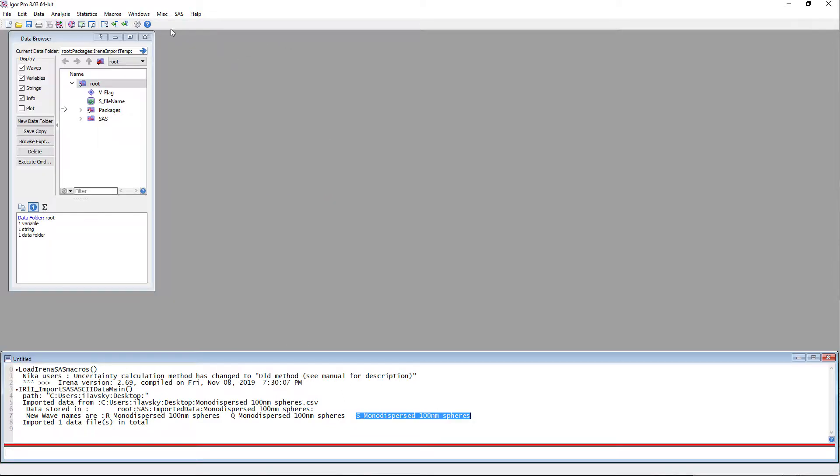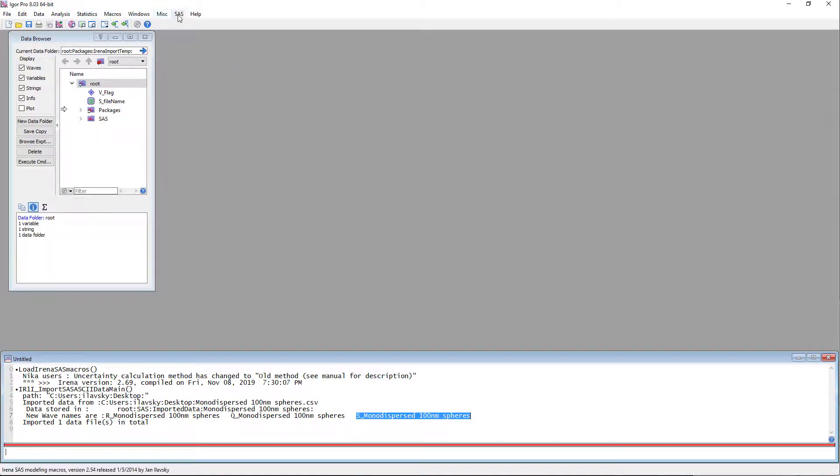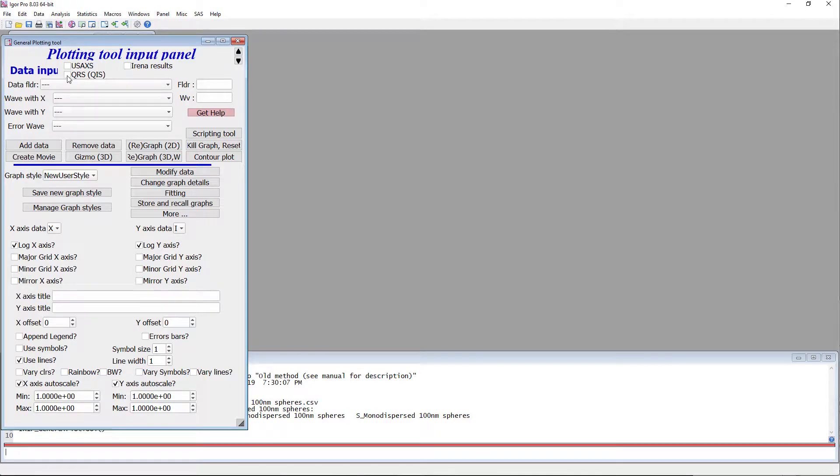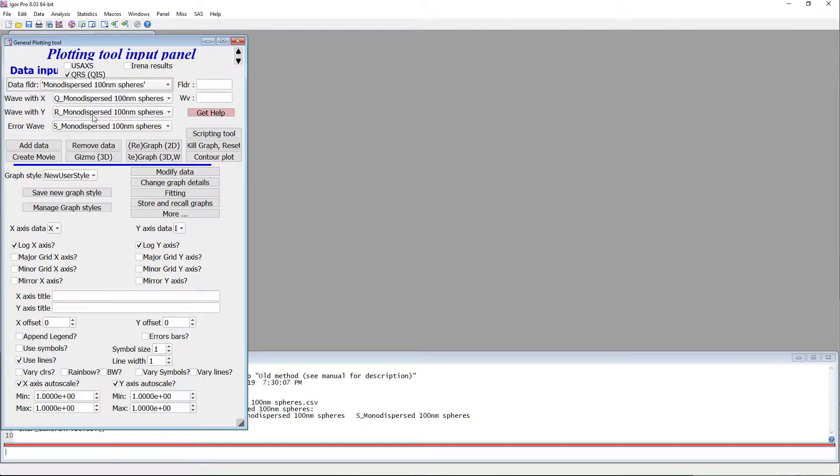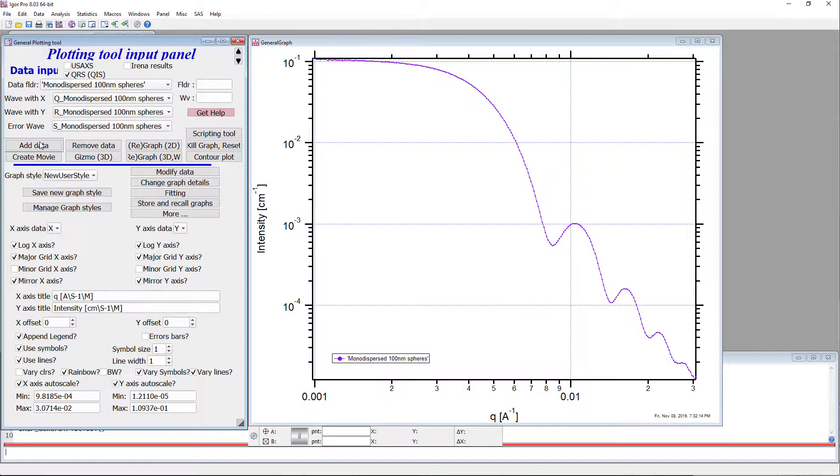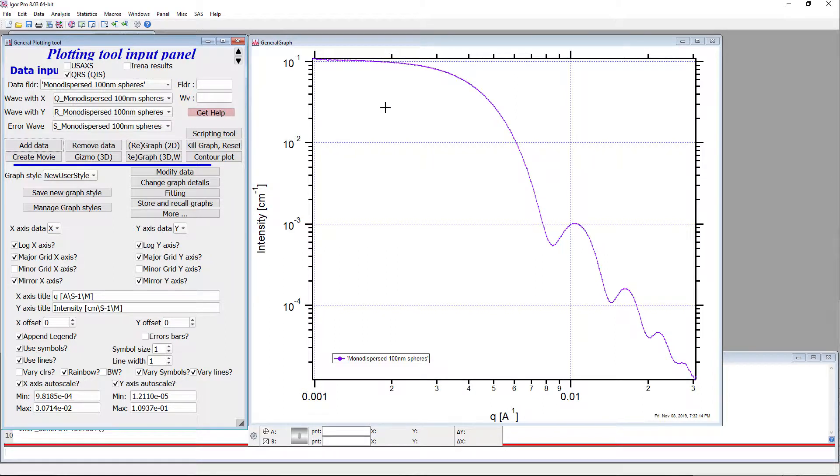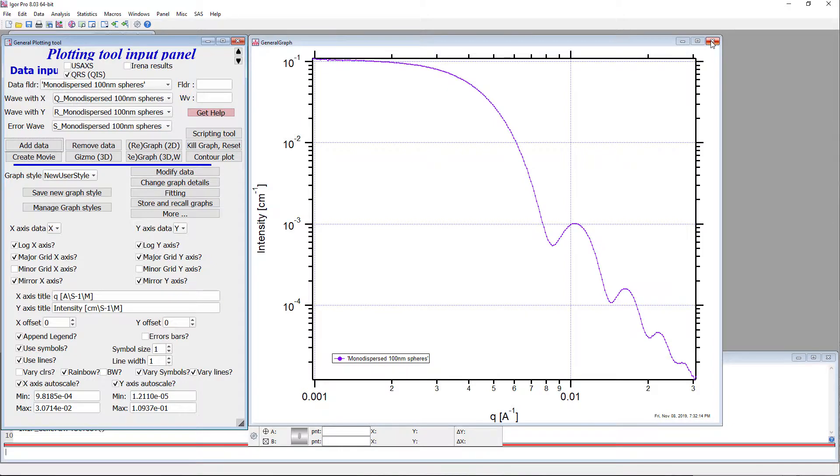So now we can go and kill this alone. With that, we can go in and plot the data. So we do plotting tool, so a QRS. Pick the data. Add the data. We're looking at a data set we're expecting. That looks fine.